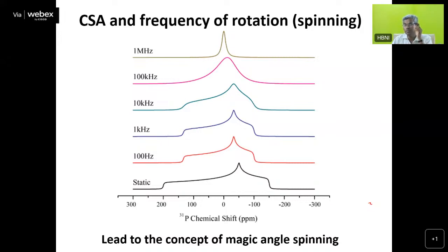that is the interactions present in the solid state. This we have repeatedly been telling in the last two lectures. The first one is the dipole-dipole interaction. Second one is the chemical shift interaction. And the third one is the quadrupolar interaction. Quadrupolar interaction is valid only for nuclei with spin greater than half. That we will come to a little later, maybe after 2-3 lectures. But among the three main interactions, the two main interactions we will discuss.